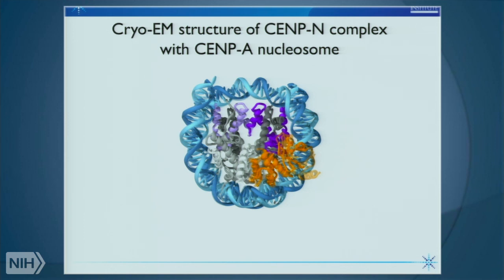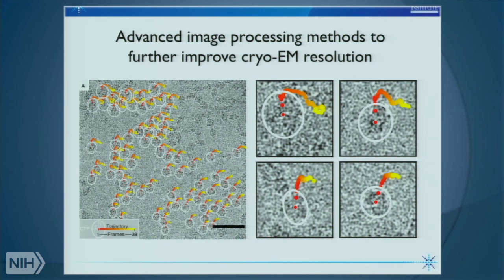So these are several examples where I think it's hopefully clear that cryo-EM methods can take on relatively challenging examples, things that might be difficult to crystallize, things that might have multiple conformations. But one of the things that we've always worried about is to see if we could actually do better with resolution. And this is work that Alberto Bardesaghi in the lab has been really exploring and pioneering for many years, whether we can actually make better use of the images that come out of these direct electron detectors, and correct for things that go beyond correcting at the whole image level.